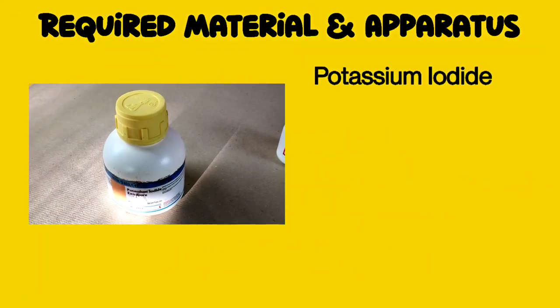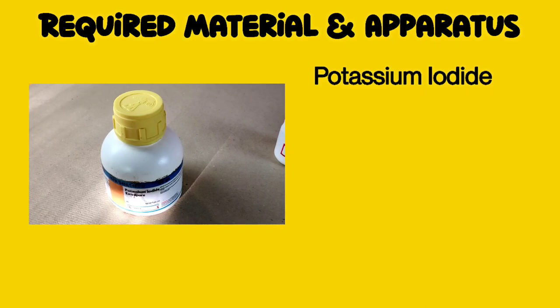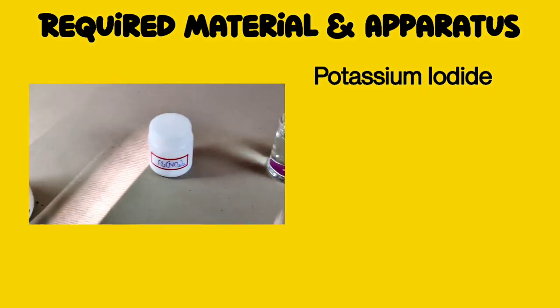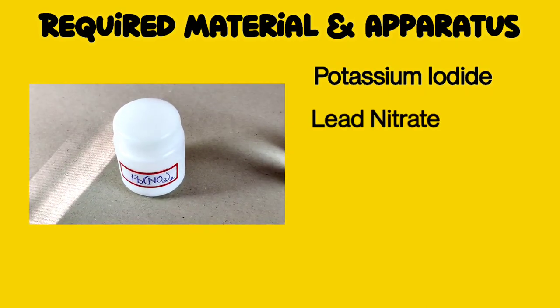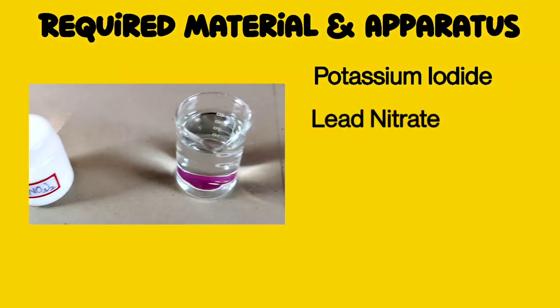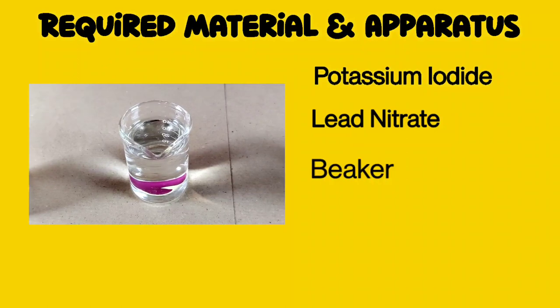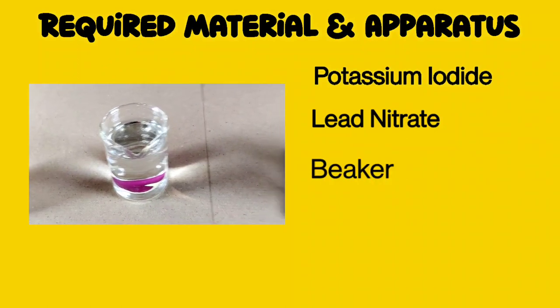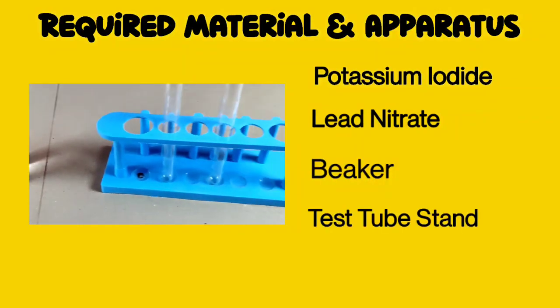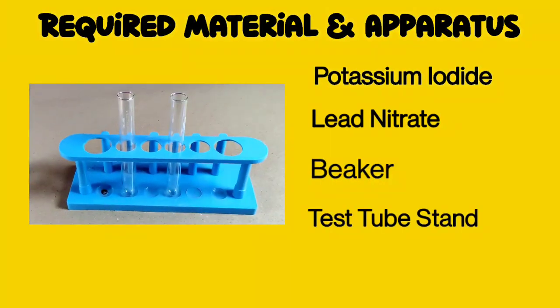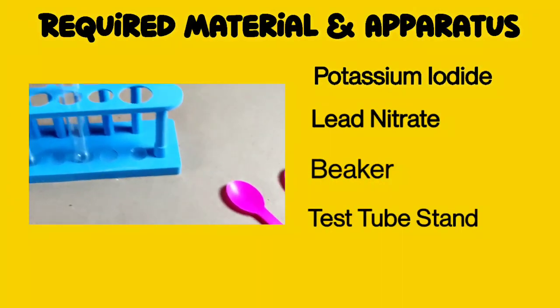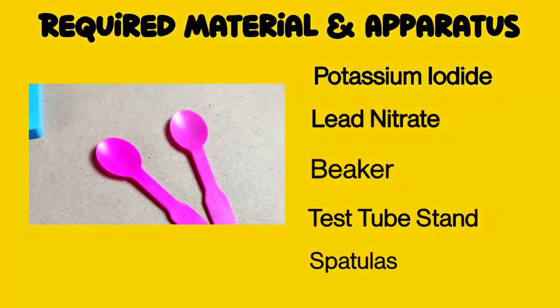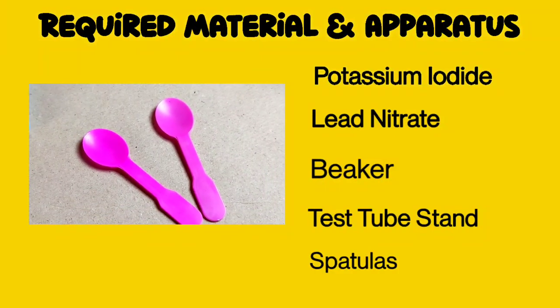Required materials and apparatus: potassium iodide, lead nitrate, beaker, test tube stand, and spatulas.